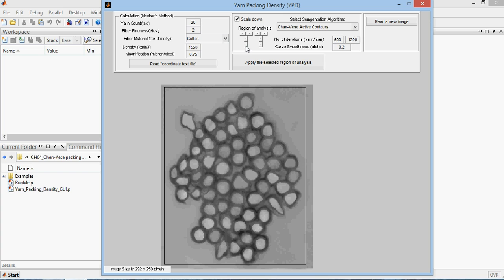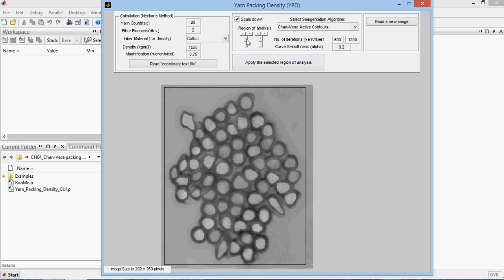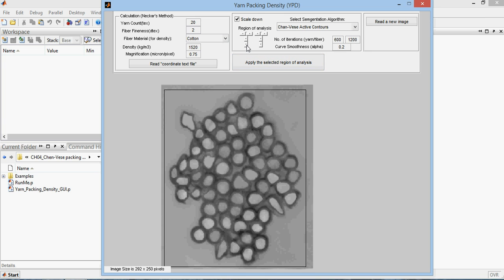Once you do that, you have this selected here, chainviz segmentation model or active contour, and the parameters here. You need to set these two parameters. These two parameters are the number of iterations that the program uses for the numerical iterations.